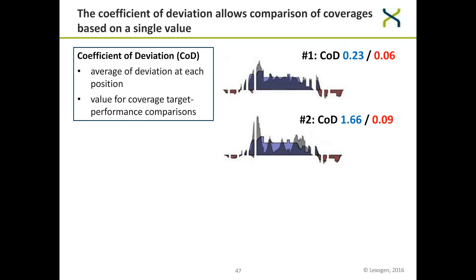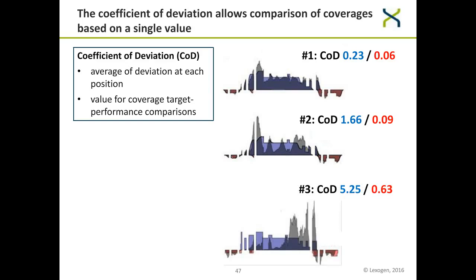And actually, just by comparing the COD values, you would already think, okay, I don't know if I really can compare this to experiments. I've included also one extreme case where the RNA was degraded. So that gives you a COD value already of more than 5. However, that could also be because you are using a 3' mRNA sequencing method. Nevertheless, that's already a first quality measure that is important to decide whether the samples are concordant or not.